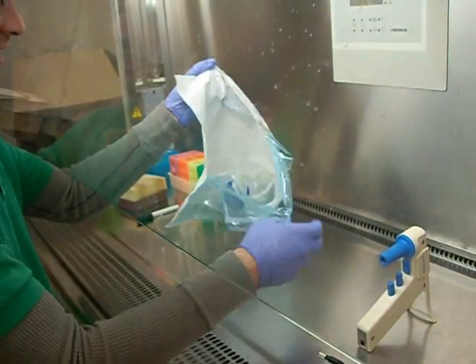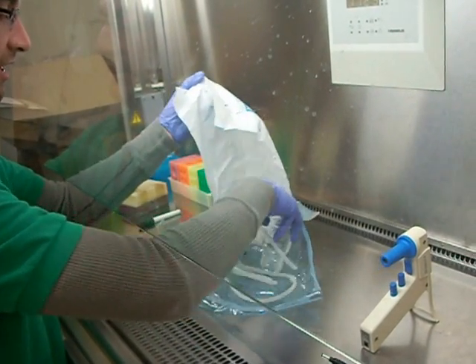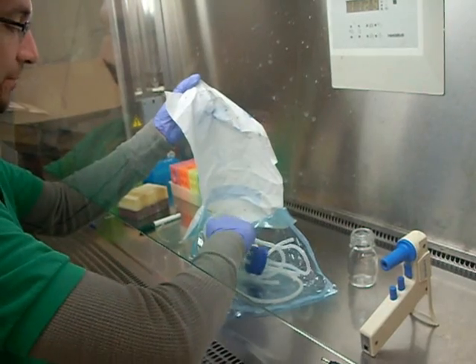Now we're just going to take the tubing out of the autoclave bag, the reservoir, and connect it to the pulse dampener.